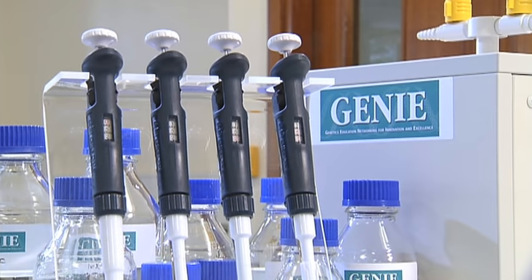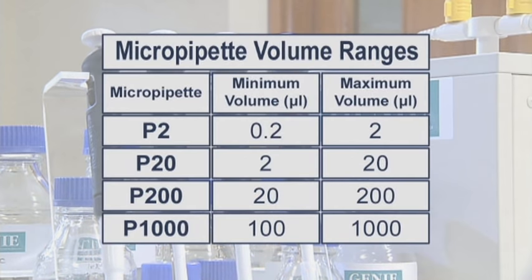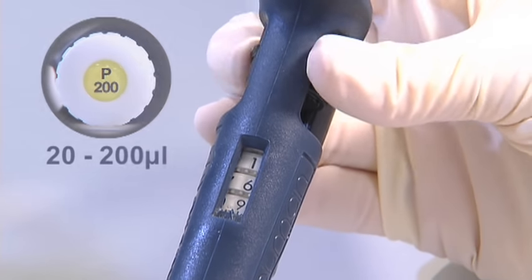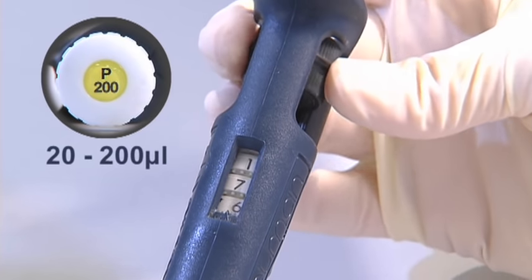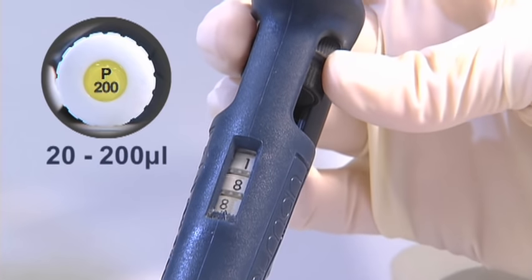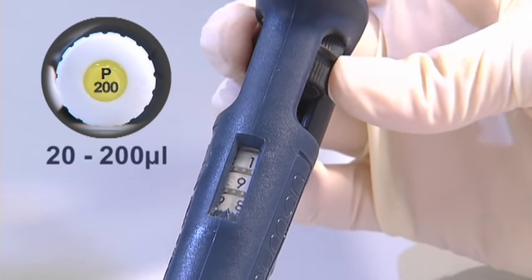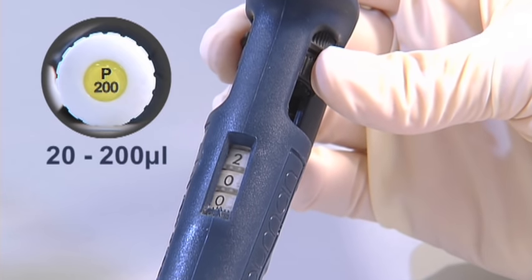A pipette is an expensive precision instrument. Improper use will damage the pipette, so correct use is essential. You should never use a pipette to measure volumes outside of its range. For example, using a P200 to pipette lower volumes such as 10 microlitres or higher volumes such as 250 microlitres will result in inaccurate volume measurements and will damage the internal mechanism of the pipette.